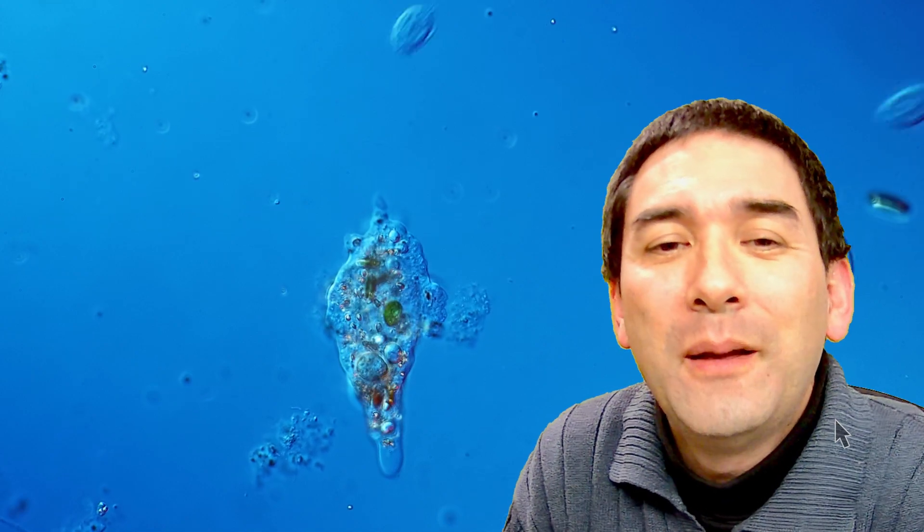Okay, and in time-lapse you see how the amoeba is changing its shape and moving around and this way also engulfing and hunting down food.